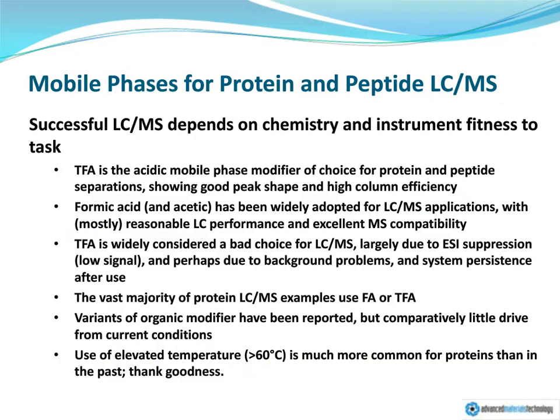So we've talked to this point predominantly about characteristics of stationary phases. What I'd like to do is change a little bit here to discuss mobile phase characteristics, and specifically focus on what we would need to do in terms of modifying mobile phase characteristics that might allow us to take even further advantage of these improvements in stationary phase materials, and particularly when keeping an eye on detection using mass spectrometry.